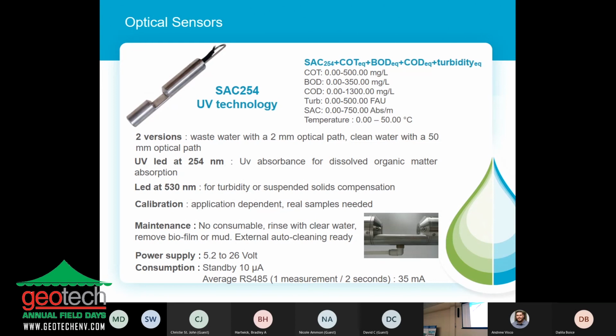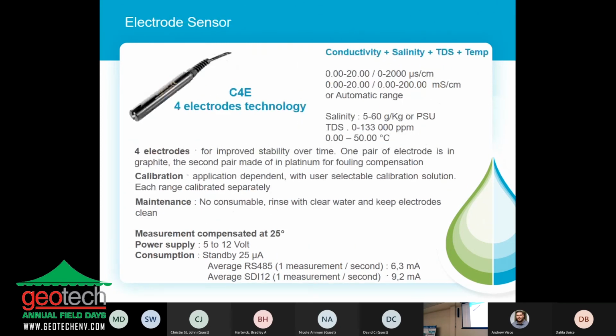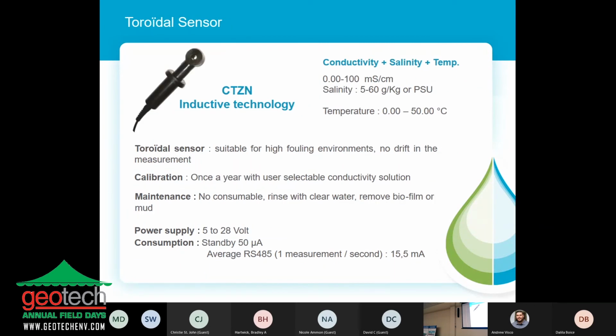Can you refresh my memory? Did you have a high range conductivity sensor available? What is high range for you? I don't know. How high do you go? I'm just curious. We can go with the 4 electrodes one up to 200 millisiemens, which is 200,000 micro. And the toroidal is 100 millisiemens, which is normally more than enough for any application in natural water. Yeah, occasionally, in saltwater intrusion applications and stuff like that, people will require a much higher range than is available in a standard grab sample device.